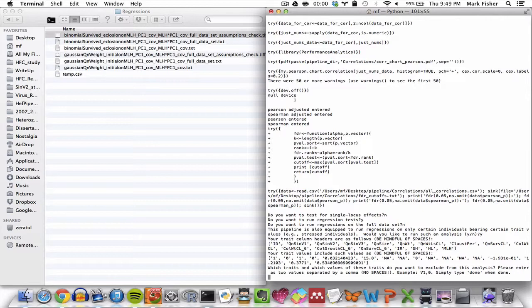Now, it's possible to create subsets of data using permutations of traits and values across several different traits, or even within a single trait, provided that this trait has more than two values in the trait file, i.e. acceptor.csv in the example data. So for instance, I know that samples in the example dataset are either 0 for uninfected by virus 1, 1 for infected by virus 1, or NA to indicate missing data for virus 1. And I want to focus on infected samples, so I want to remove samples that have either 0 or NA as values for virus 1.